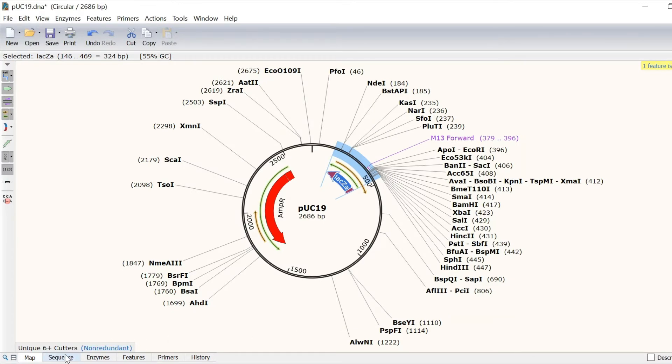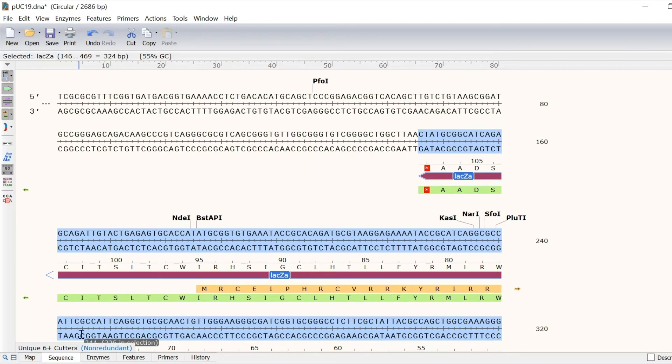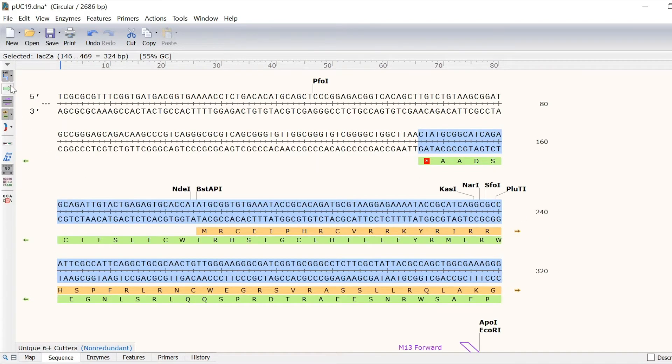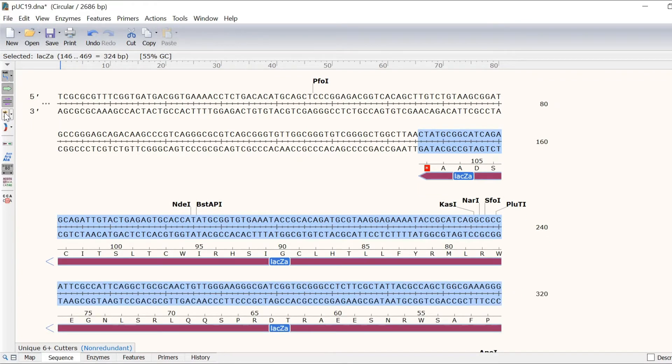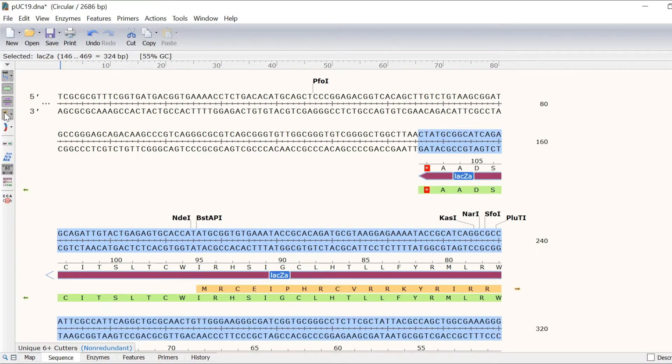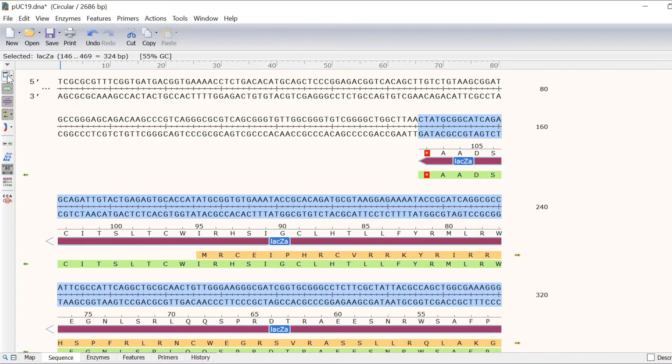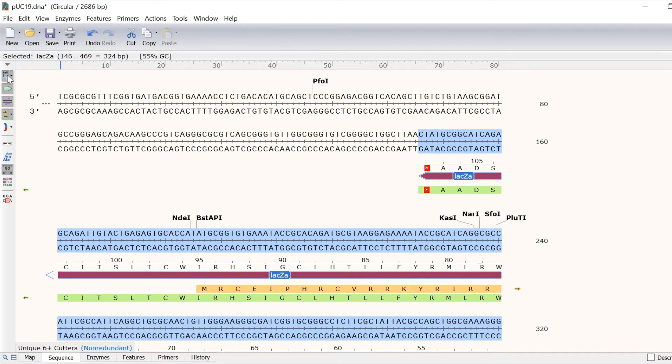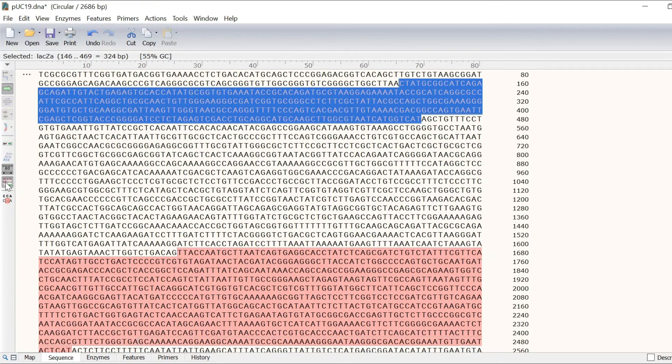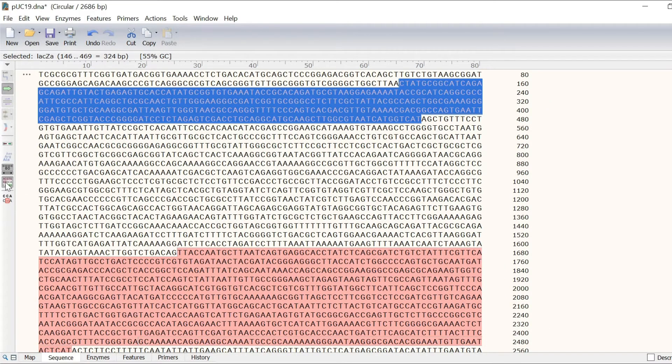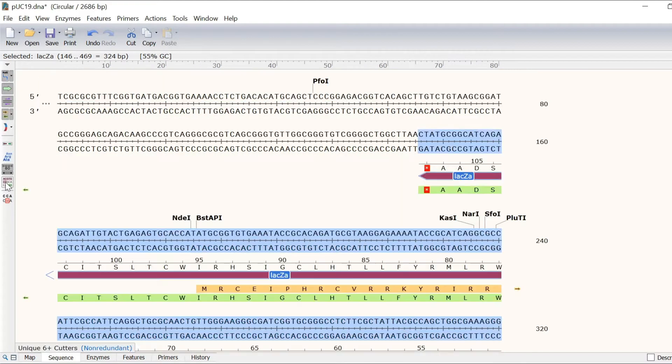In the sequence view, you can use the side toolbar to show or hide features, translations and open reading frames, restriction enzyme sites, primers and DNA colours. You can use the compact view to show just the top strand sequence coloured according to features.